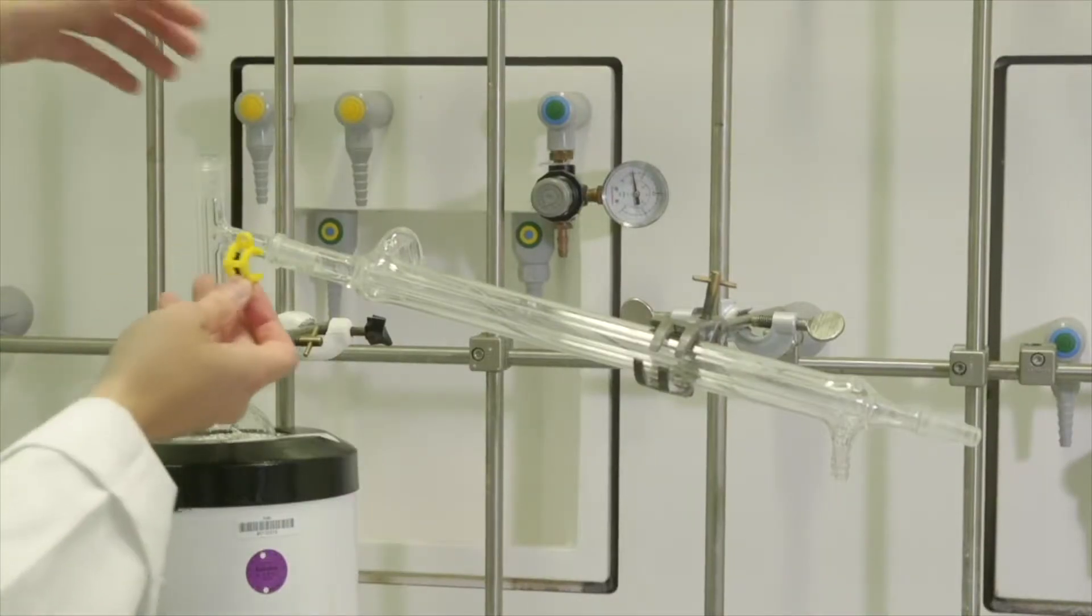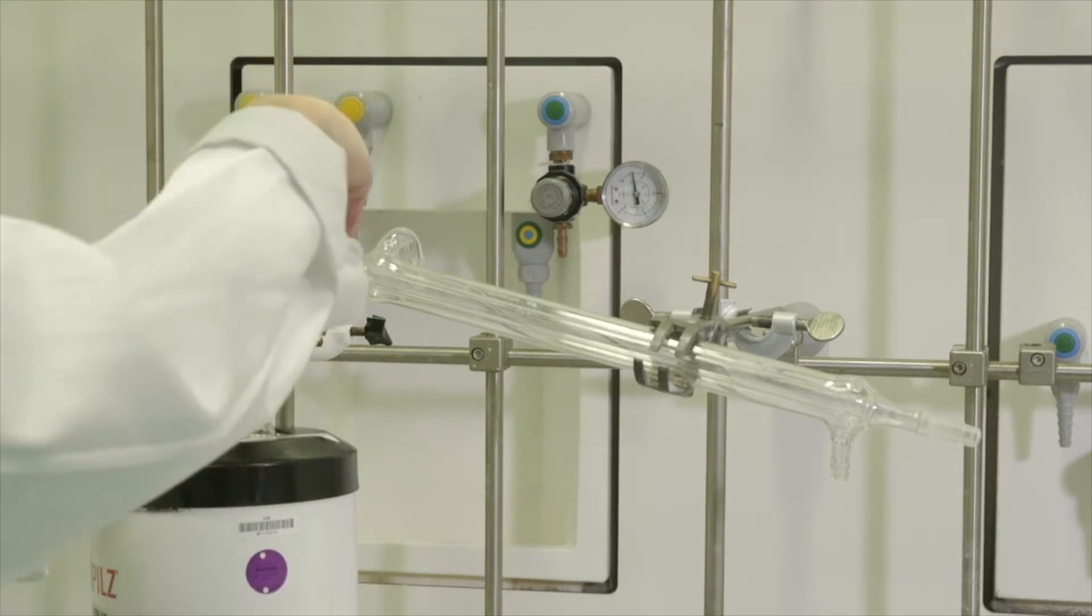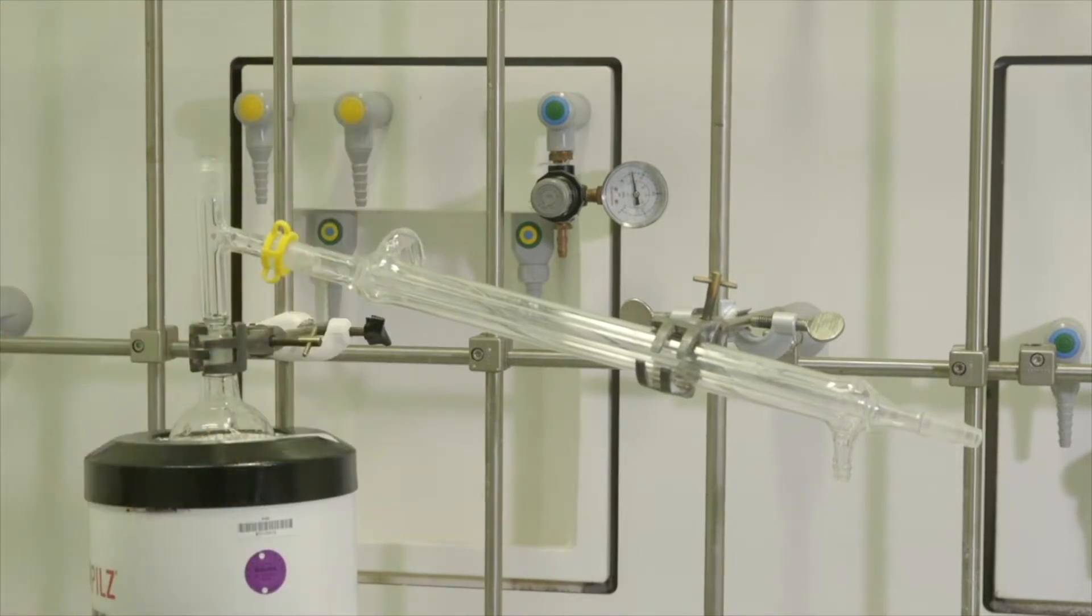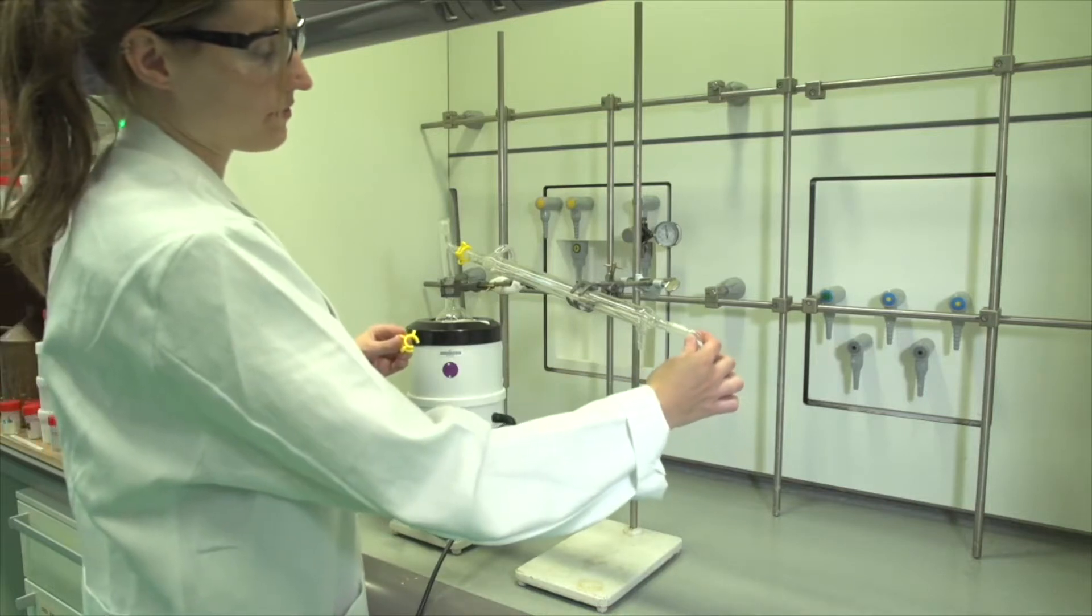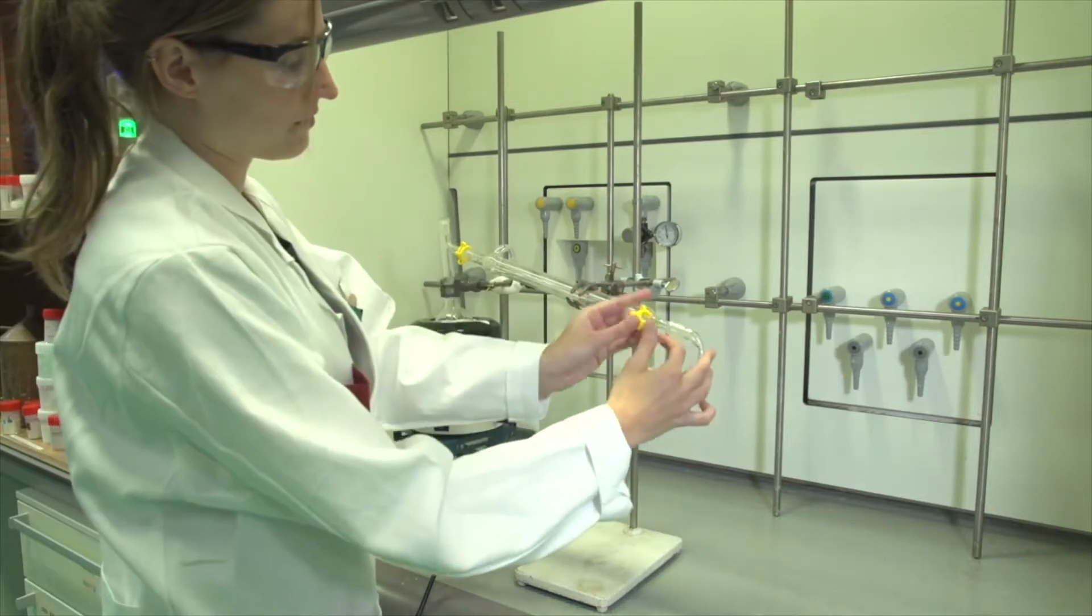Ensure that the condenser is positioned at a slanted angle. Secure the whole setup with a plastic clamp. The bent adapter is attached to the other end of the condenser and secured with a plastic clamp.